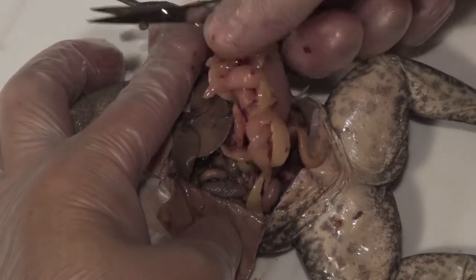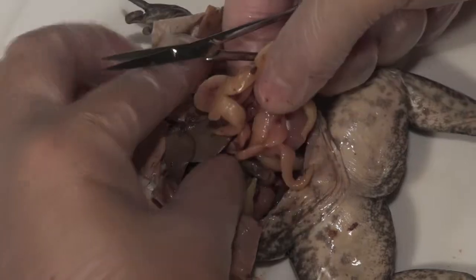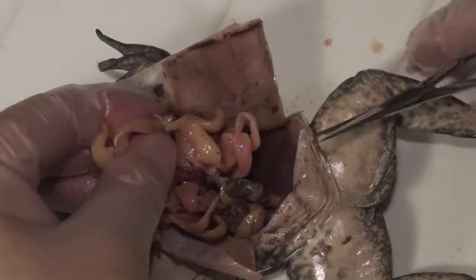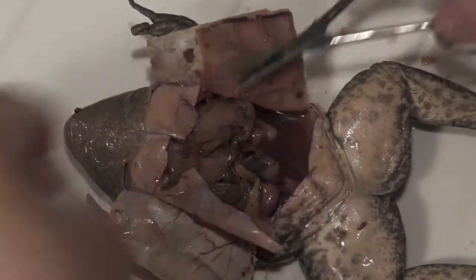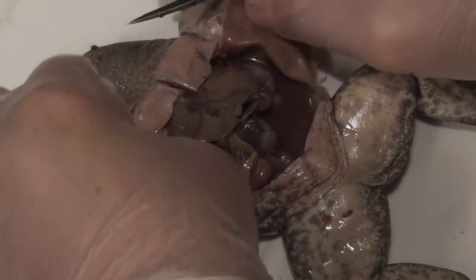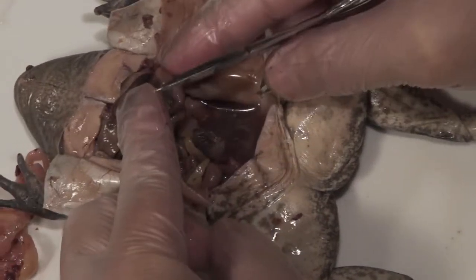There are often large fat bodies on both sides, and these can vary in size. In order to see the structures better, it's often better to remove those. Go back in, get close to the base, and cut those fat bodies away. Now you can see structures like the liver and the stomach a lot more easily.